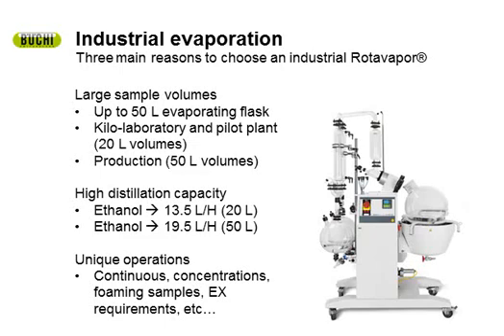If you're working in an explosion-proof environment, EX-rated environment, well, there's industrial evaporators that are ATEX compliant. Also, very unique thing with industrial evaporators is that you can actually concentrate with some of them. Not all of them, so please do your homework. But for instance, the R220SE, you can actually concentrate to a residual volume with this, assuming you get the correct accessories. So if you're doing something unique like that on industrial evaporation, you can do so.